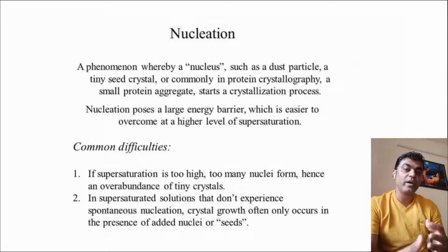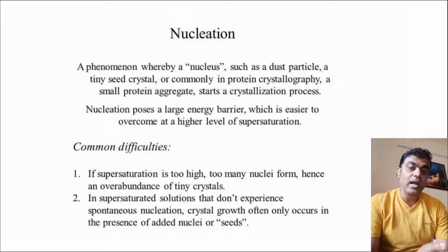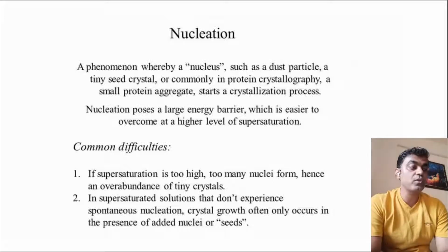It may be on one side, the growth may be happening in one particular plane, and in that plane you see the formation of the crystal is happening, but in the other planes it is not. Until and unless it is a 360 degree spatial uniform crystal development, again the problem remains, and we will not be able to use that type of crystal for further structural studies.